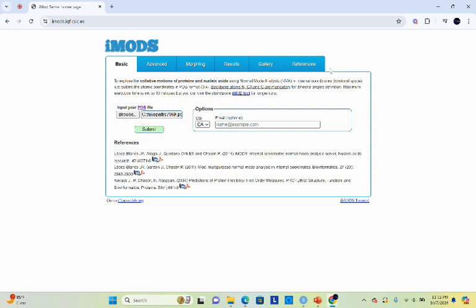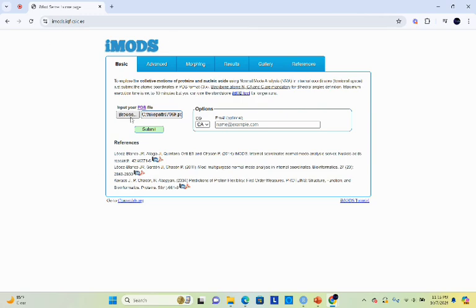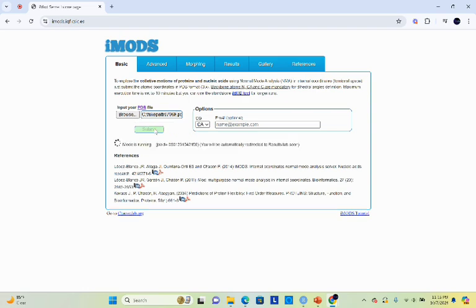So here we will use iModes. For this purpose you have to open the iMode server. The home page of iMode is very simple. Here you can see the interface. So here you have to put your protein structure. Remember the protein structure should be in PDB format. Then click on submit. It will take some time and then it will give you the result.